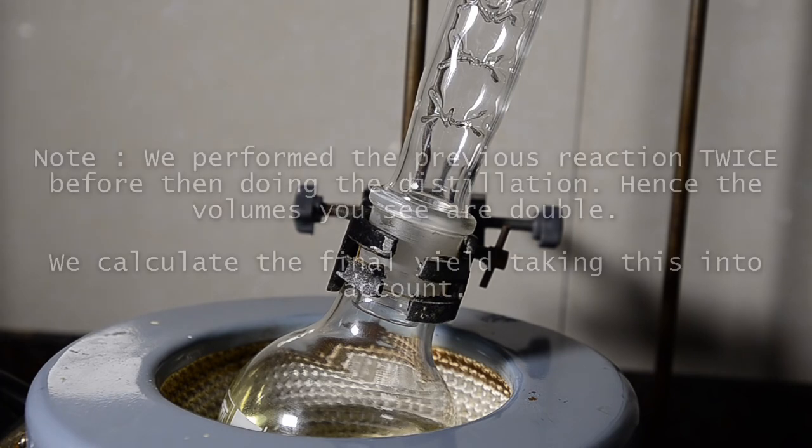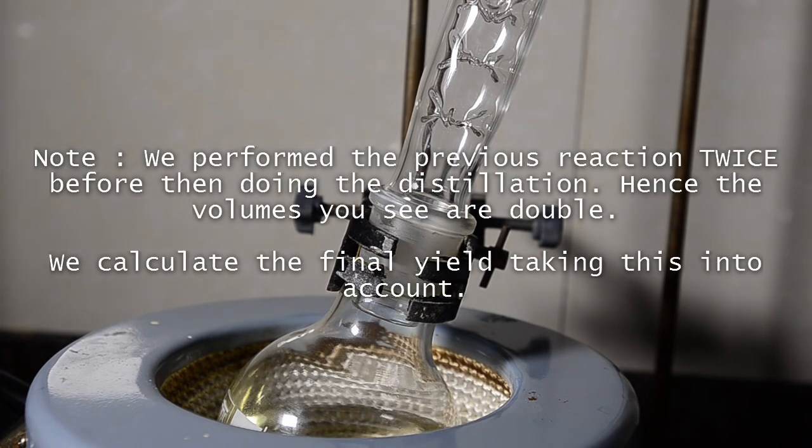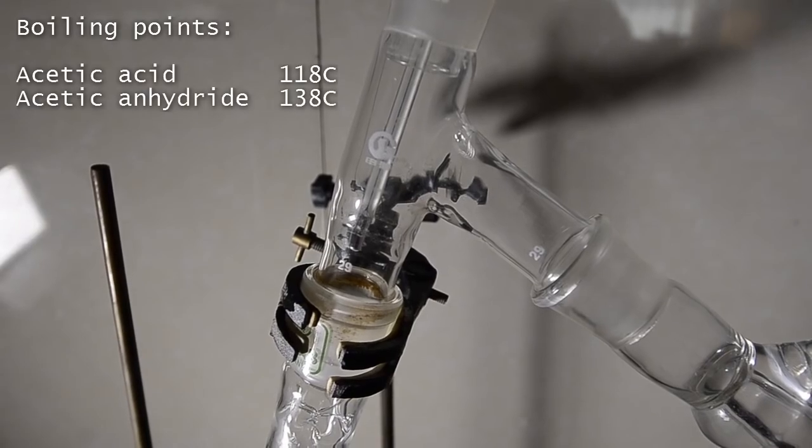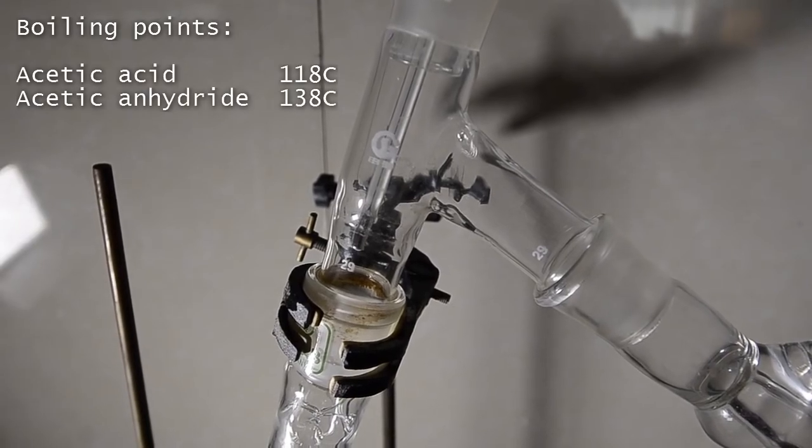To purify our crude product, we'll fractionally distill it. We're using a 40 cm vigreux column as you can see here. We've chosen to fractionally distill because acetic acid and acetic anhydride have boiling points which are around 30 degrees apart.